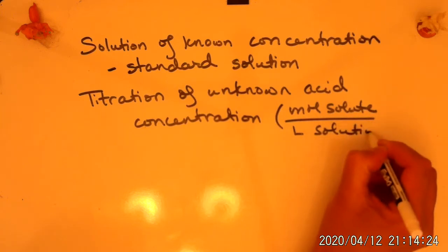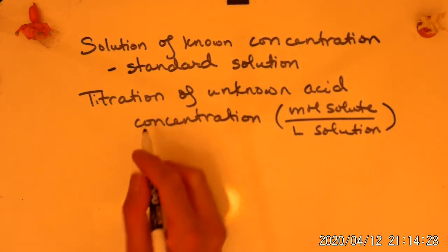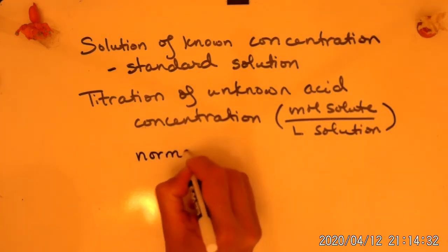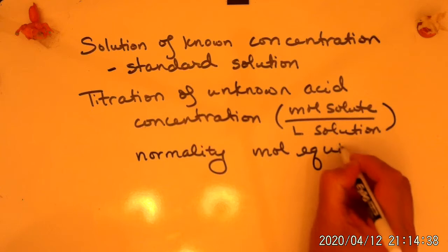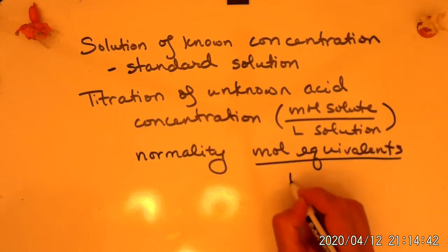Because right now, we do not know our solute. So we talk about normality. This is in moles of equivalence per liter of solution.